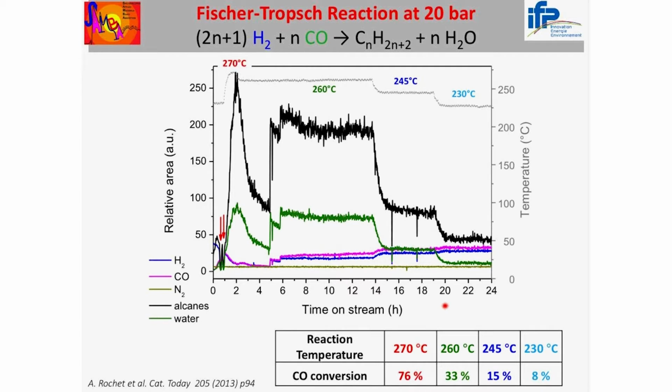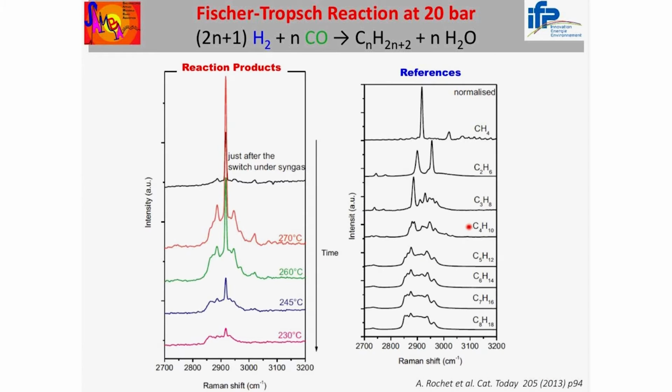That means, as you can see here clearly from this variation of intensity for the different reaction products, the catalyst is more active here at high temperature than at low temperature. Now, that's for the catalytic activity.